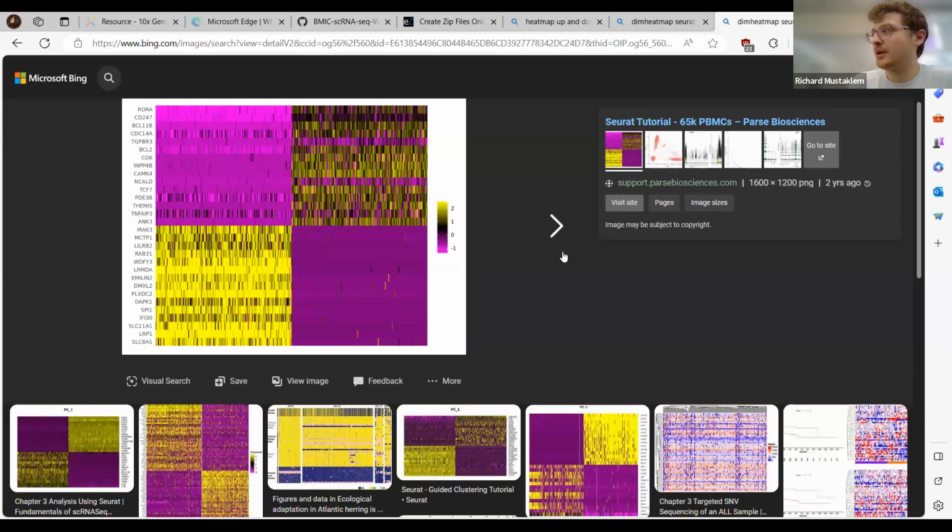This is what we're doing inside Seurat. We're pasting all those principal components together. In my code, I think I wrote an annotation that we want to cut off around principal component 7 or 8, because that's when the separation gets a little messy, and from there on it is weird. So that's when we cut it off. So far, are there any questions on this? I can keep talking about this. Yeah, what's up?